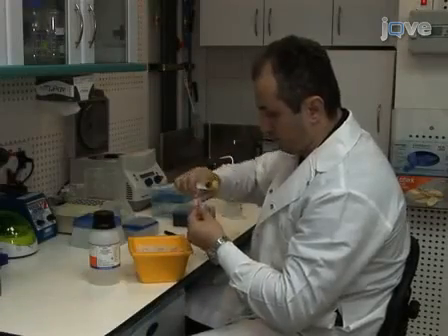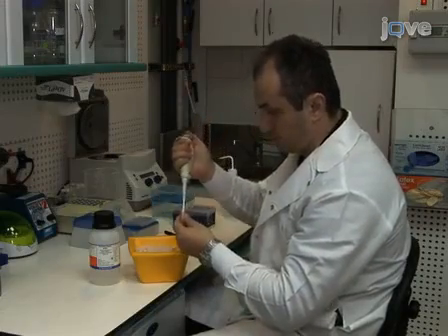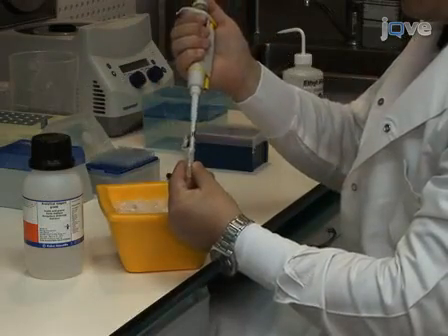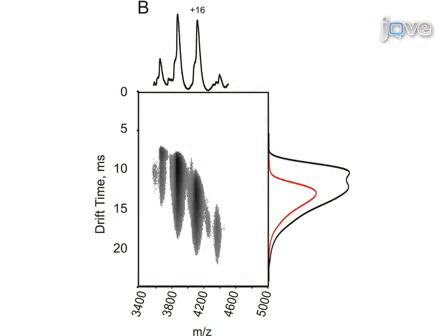Finally, to identify the unfolded conformations and assess the acquired data, manually induce dissociation of the protein complex by titrating the sample with acetic acid over a pH range of 2 to 7 and record the data. Proceed to analyze the data.